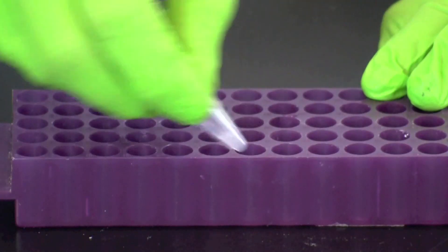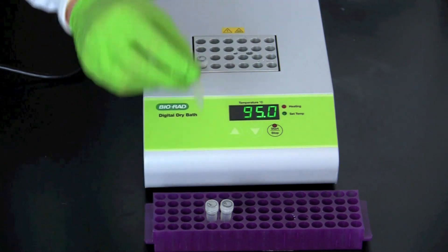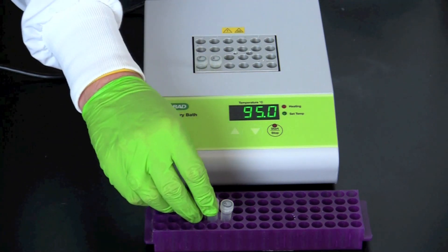Remove the tubes from the 56 degree incubation and vortex or shake them. Then incubate the tubes at 95 degrees Celsius for 5 minutes.